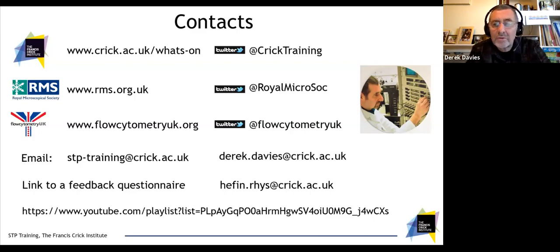I think the first one you've covered, Kevin, but it may be worth just reiterating it, in the fact that in normal flow cytometry, we start with forward and side scatter, which of course we don't really get on an ImageStream. So, how do we define where our cells are? What's our first level of gating?